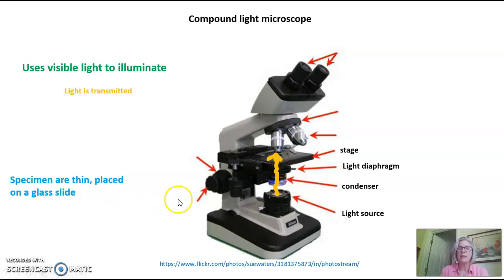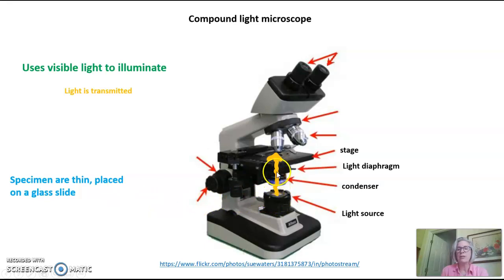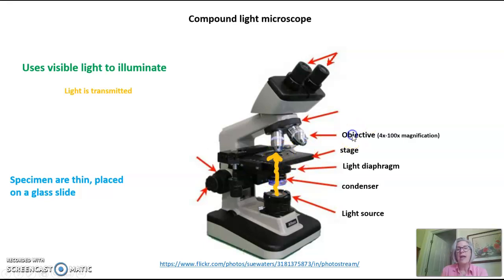Specimens have to be thin to be looked at in a compound microscope — they're very thin and placed on a glass slide. So the light comes from the light source through the condenser, to the light diaphragm, through your specimen on your glass slide, and then it goes into one of these objectives. This is the first place of magnification.